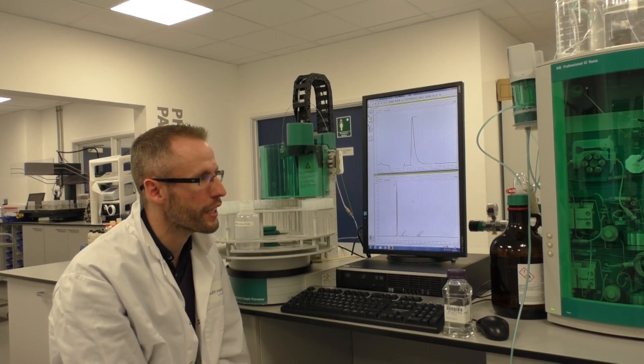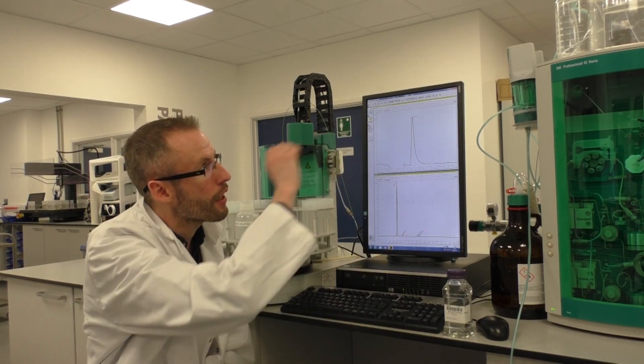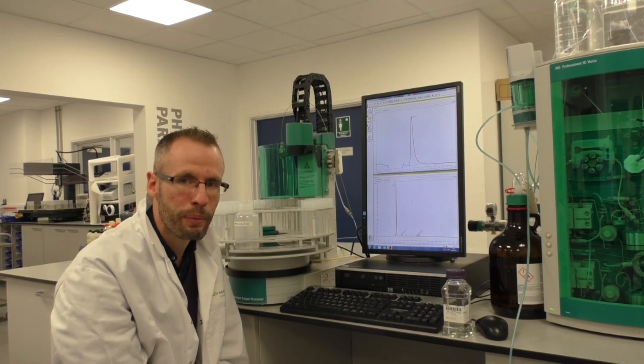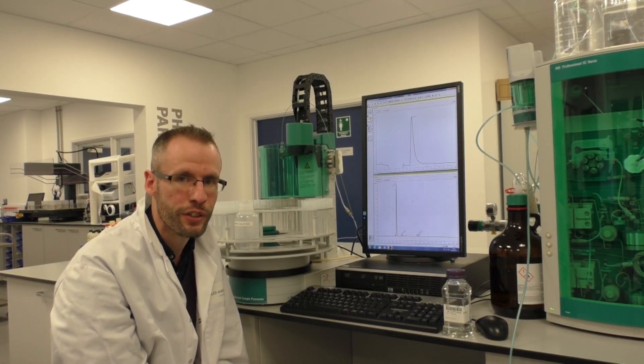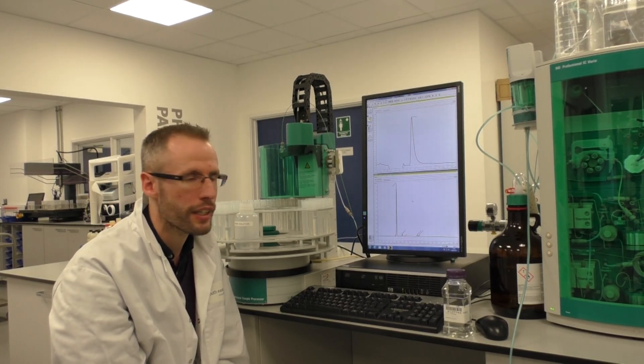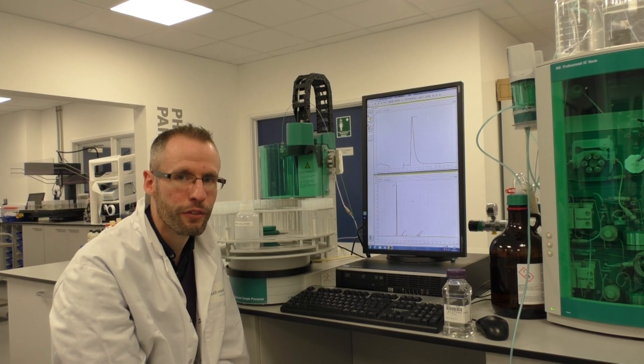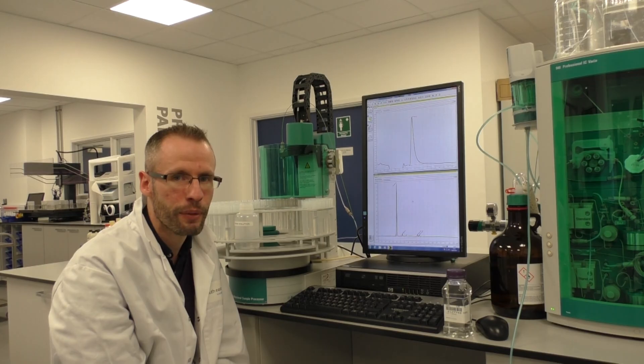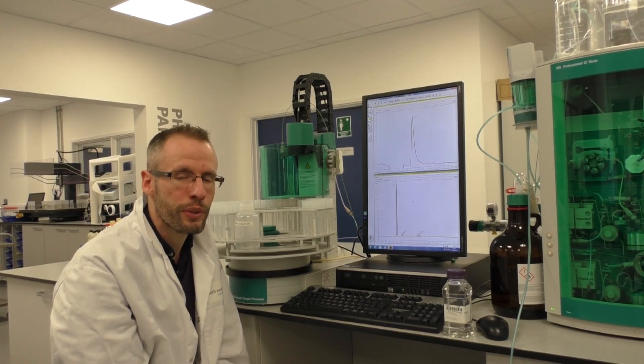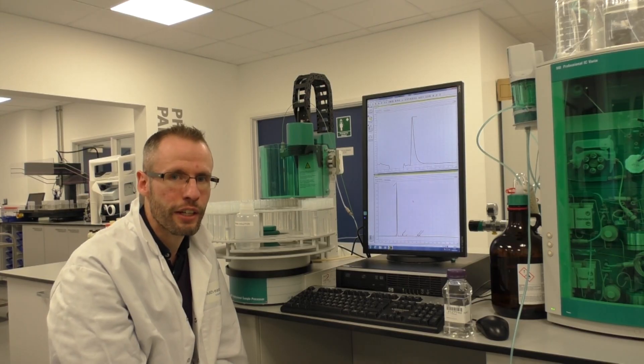One of the key features we find we have with it is our reagent we use for our oxyhalide method has a continuous auto-regen on it. So we prep up a stock concentration solution and add a solvent and some water and we make that once a month and it just fills itself up continually as we run. So we don't have to worry about filling up our reagent every day and making sure that we can't do as long runs as we want due to running out of reagent.